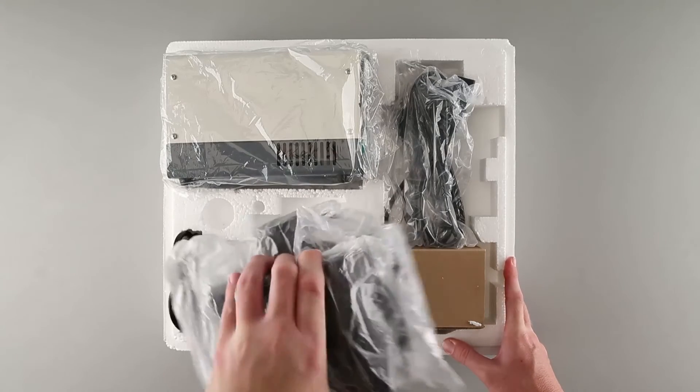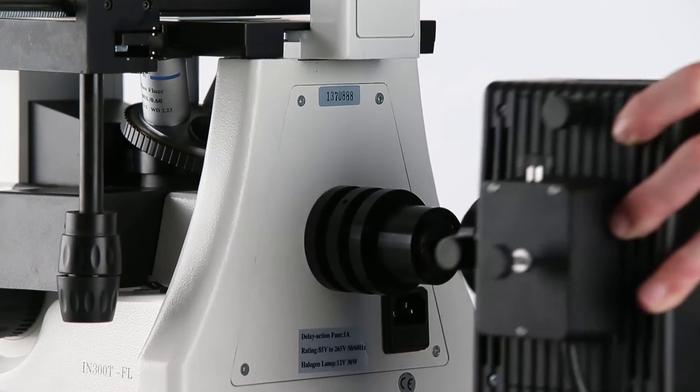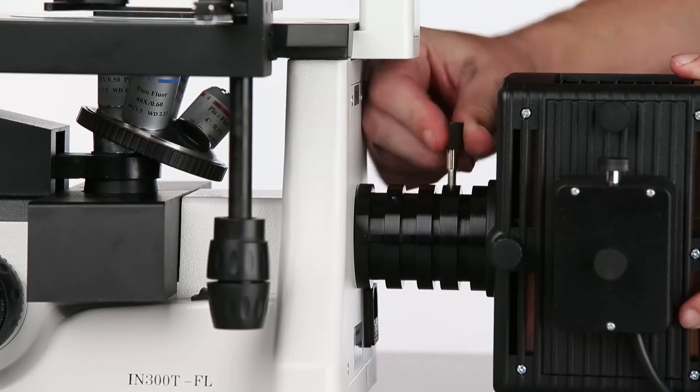Now we'll unpack the episcopic lighting assembly. The episcopic lamp assembly will slide onto a port on the back of the microscope, and is secured by turning the locking screw.